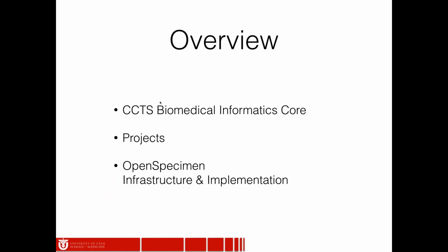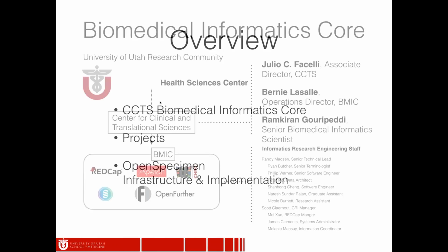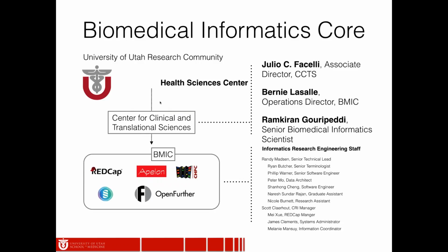Just a quick overview of the core, the projects that the OpenSpecimen fits in within our core, and then I'll go over the infrastructure and implementation of our OpenSpecimen setup. So this is just a quick overview of where we sit within the Health Sciences Center. The Center for Clinical Translational Science is a CTSA award-funded center that supports the research enterprise across the institution. We have a few key projects that OpenSpecimen will be one of.